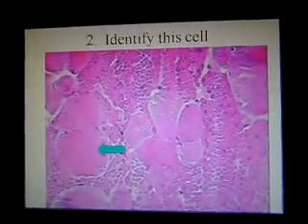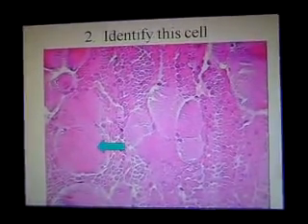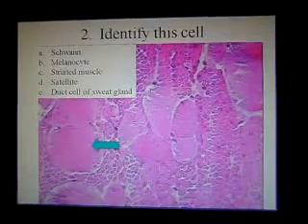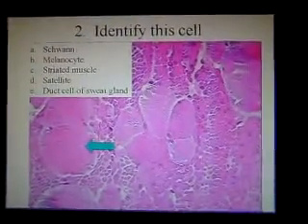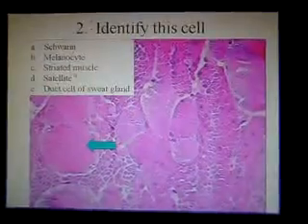I told you about that. We talked about that. Two kinds of muscles are intertwined with one another, all running longitudinally along the esophagus. Cross-section of striated muscle fiber, cross-section of smooth muscle fiber. Now remember, this is one fiber. These are myofibrils. Here are the peripheral nuclei. So this is the cell to identify striated muscle.